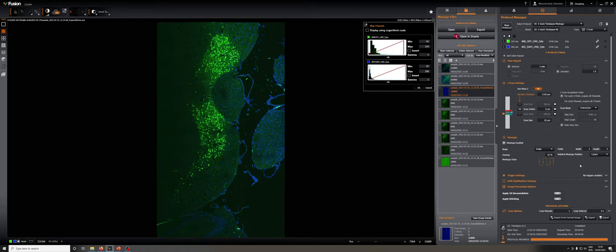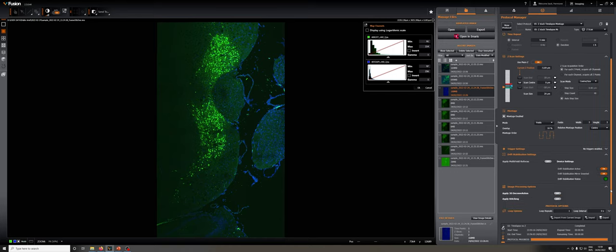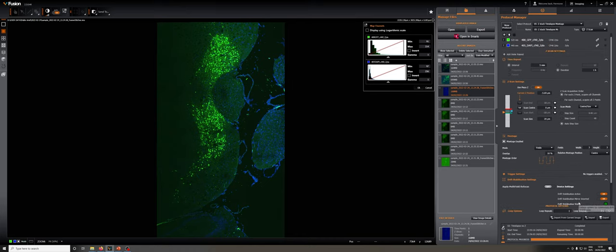And we could decide that we wanted to do this with the drift stabilization on. We could decide that we wanted to do 3D deconvolution as we go along and stitching as we go along. So this is really just a combination of the things I've shown you so far.